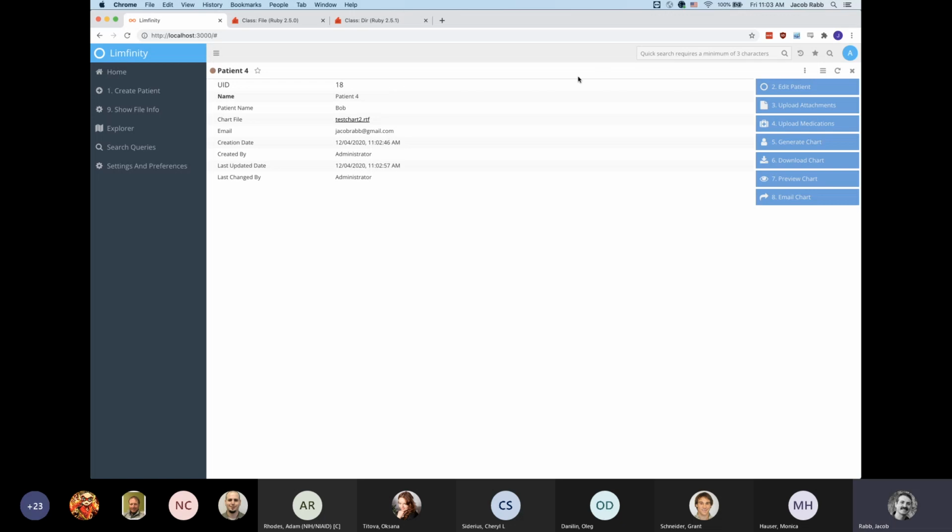But we can move on to some more interesting examples that actually involve code. For instance, I've now showed you how to upload a single file to a single UDF. But a lot of times when you're working with files, you need the ability to attach any number of them, only limited by the user's capacity to upload files and the database size.